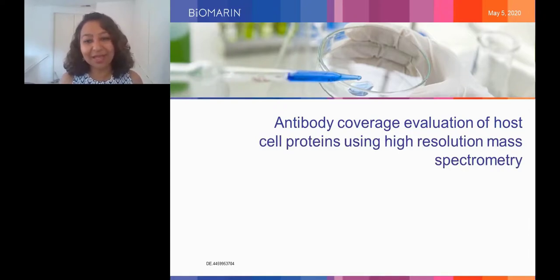One of the examples of using mass spectrometry that is my favorite in this field is actually not just using host cell proteins directly as the analyte and understanding what they are and how much of them are present, but to really have that conversation with the commercial strategy and the quality groups in the departments where these processes and testing are developed to see if the ELISA is the preferred method for commercial release, because it's commercially a very well-established technology, and it's inexpensive, it's reproducible, it's highly sensitive.